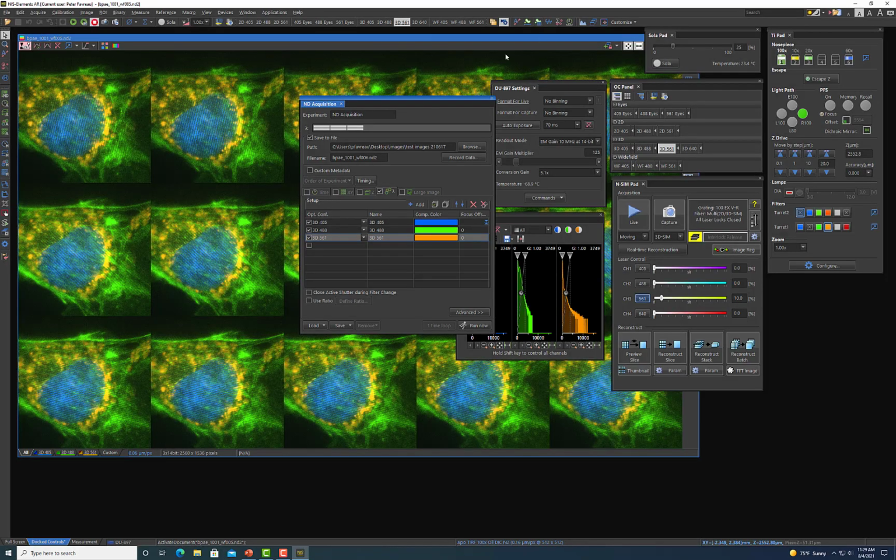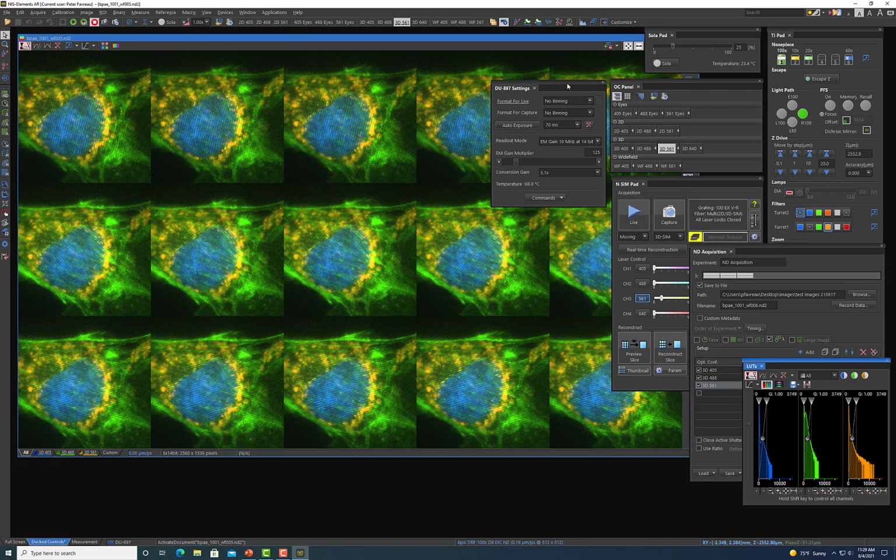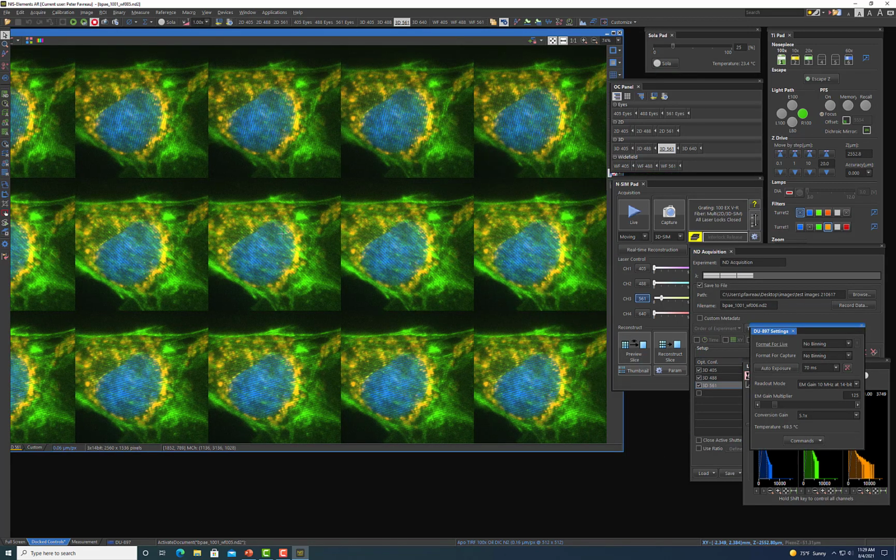Okay, so it finished its image acquisition, and I just want to draw your attention to a couple things here. The first thing is that when you actually look closely at each one of these images, you'll probably see that at each row, it looks like the structured illumination pattern is at a different angle. And that's, of course, because it is. In order to make this 15 image set, it just took images at many different angles. And what we're going to do when we reconstruct is merge all of those and do some computation behind the scenes to get a structured illumination image.